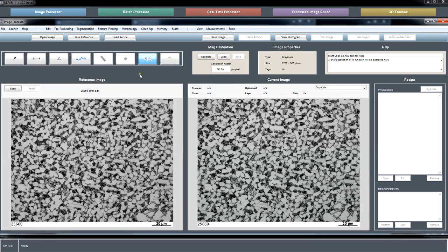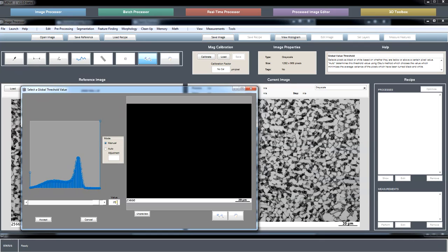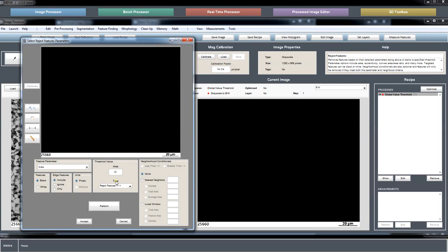I think there's, so no, I guess now that I think about it, Meg, although there isn't a button that you click to set an area of interest, we can kind of easily do that with some of the memory operations that we have available. For example, since your bars are always white, if I just set a global threshold value of 254, and then I go ahead and I reject, it's really just going to be probably anything under 100,000 pixels or 10,000.